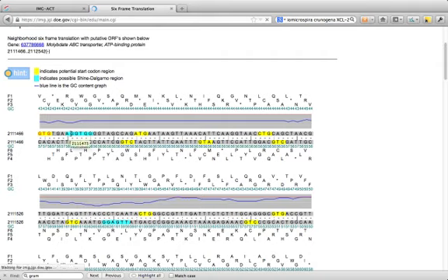The typical Shine-Dalgarno sequence is AGG. This could very well be a legitimate Shine-Dalgarno sequence for this gene. It's got the proper spacing, and there's a start codon in the DNA right here. Checking up above again, we go 1, 2, 3, 4, 5, 6, 7, 8, 9, 10, 11, 12, 13, 14.